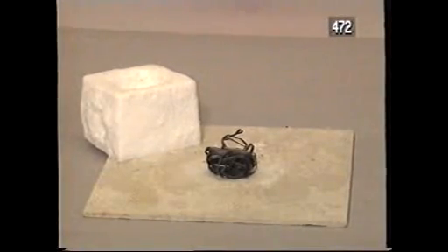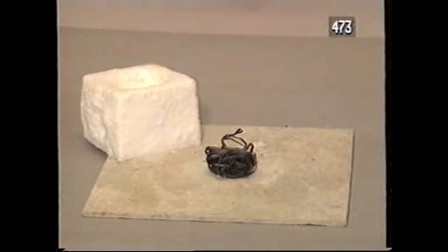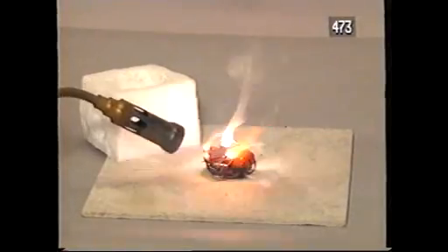I'll start with carbon dioxide that's been cooled until it turns solid. Dry ice. Here's a block of solid carbon dioxide with a hole drilled in the top, and alongside it a bunch of magnesium ribbon. I'm going to start the magnesium ribbon burning by heating it in a flame. Now once it's going, I'll put the dry ice on top of it, and you can see that the magnesium continues to burn in the carbon dioxide.